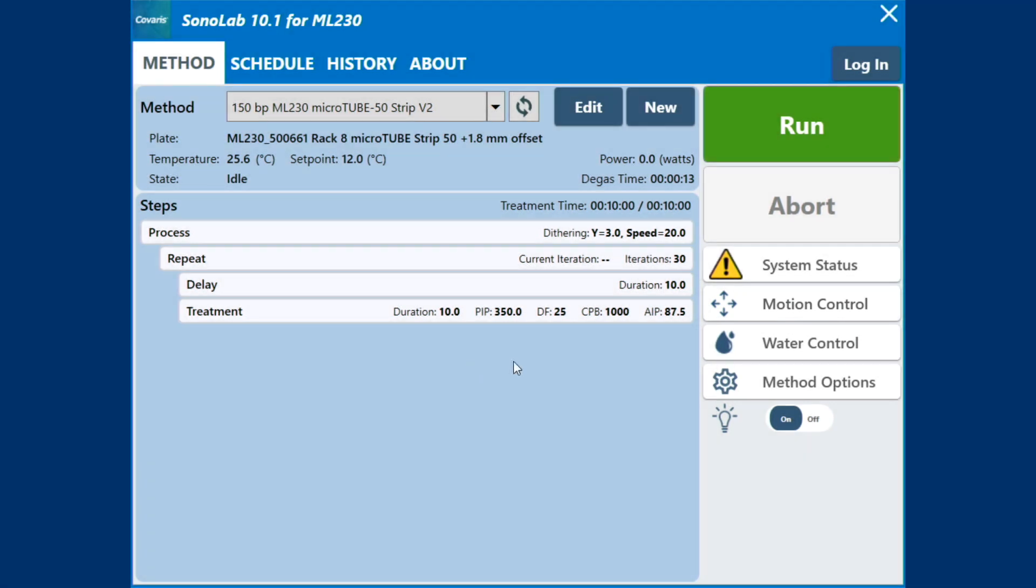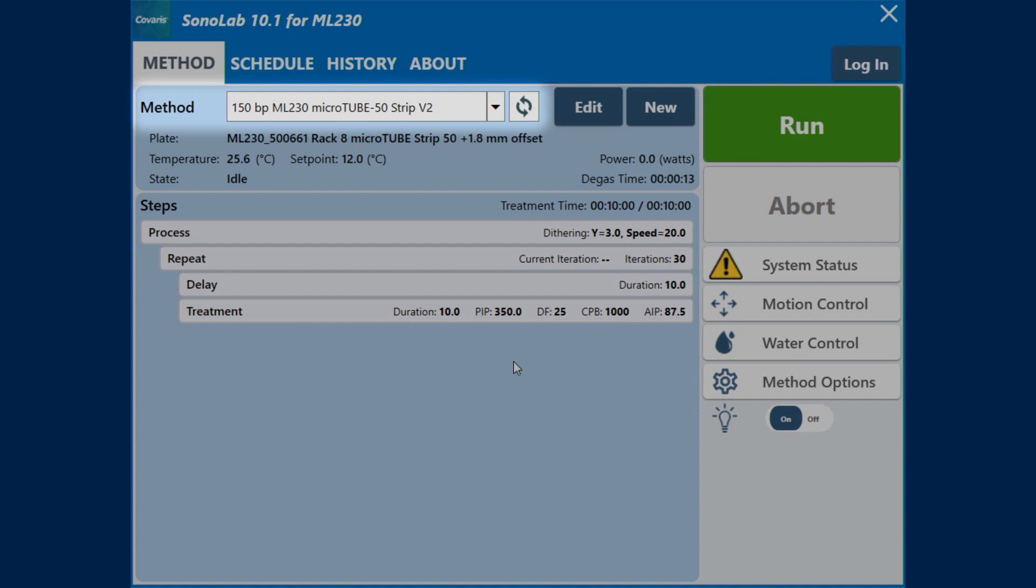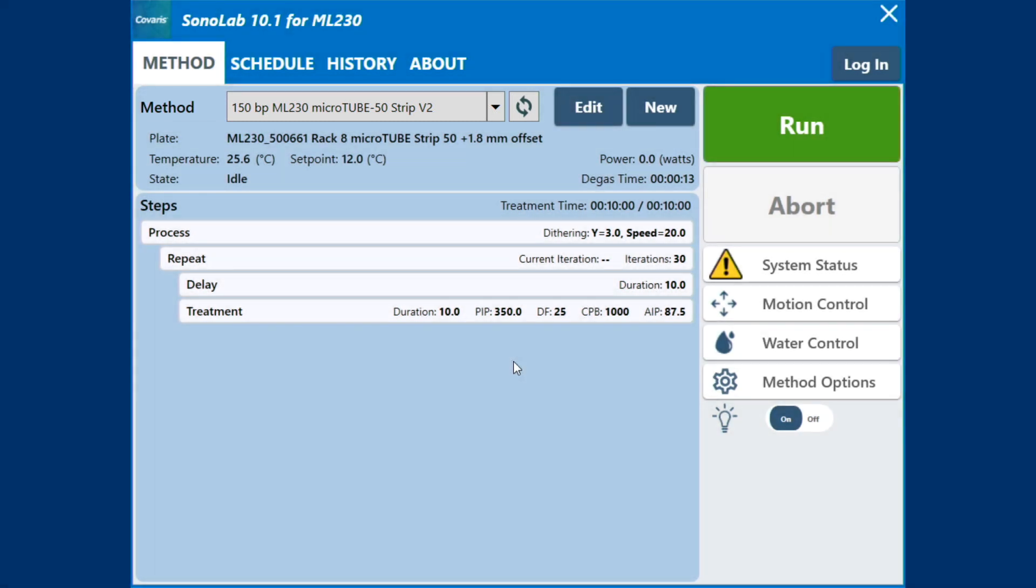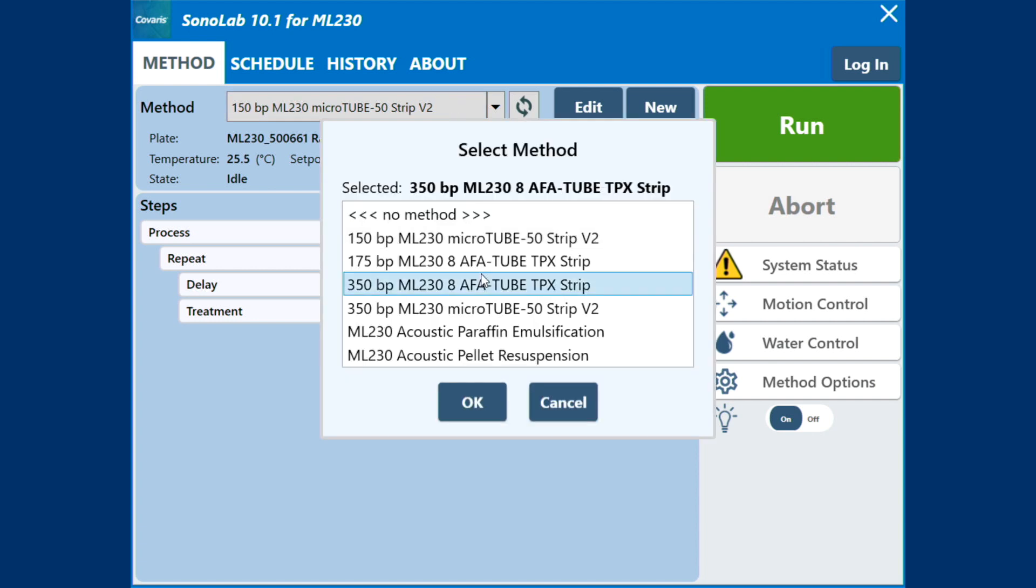To perform a run, there must be an acoustic method selected in the method box. To select and load an acoustic method, touch the method bar to display the method select pane. Scroll through the list to find the method you need. There are protocols pre-installed in the Sonolab software.